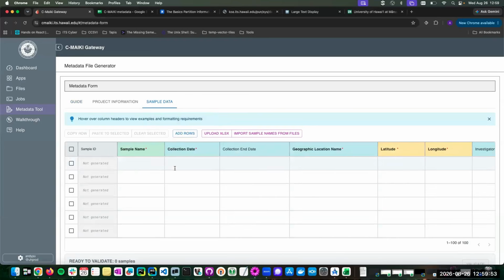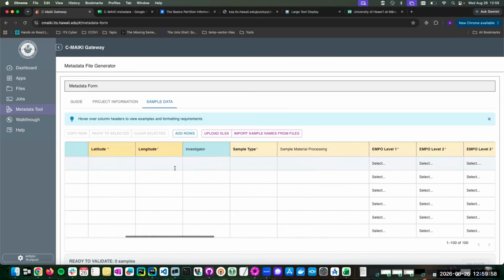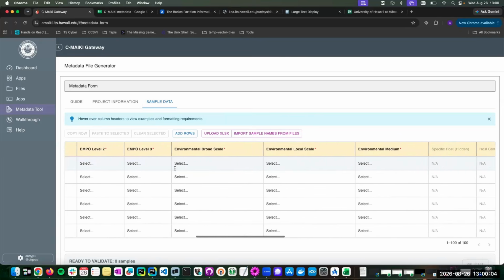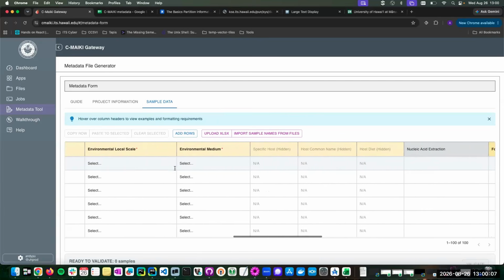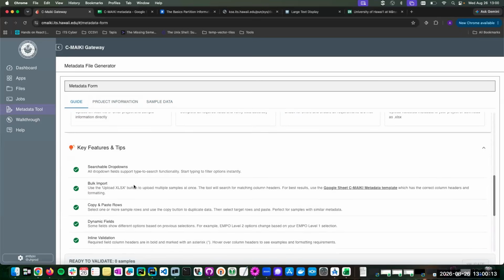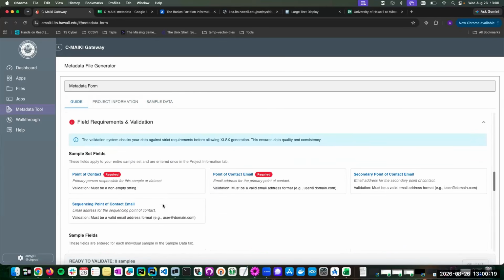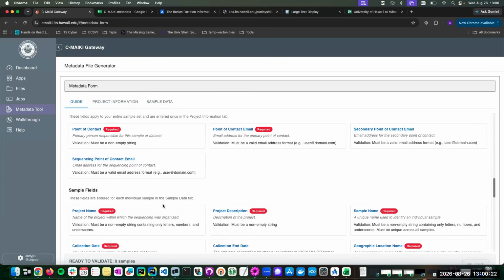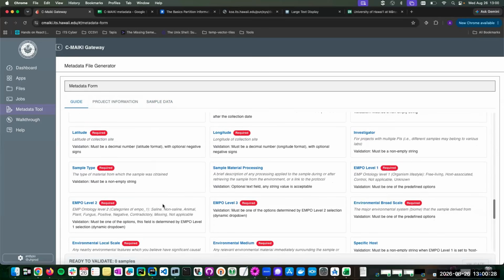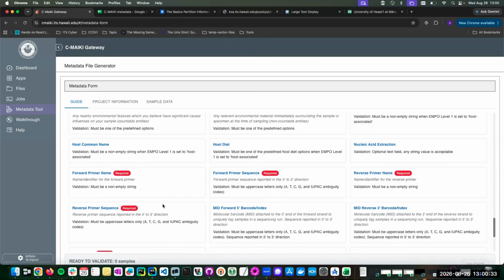Another one is that it makes your work FAIR compliant, which is a requisite of most federal funding agencies and also a requisite of most peer reviewed journals now too. So that's my personal take there. It's for data submission, right? Can you use the gateway then to submit to SRA and then you would use this metadata file for that? I don't think it's formatted as the SRA, but it will make your life a lot easier when submitting to SRA.